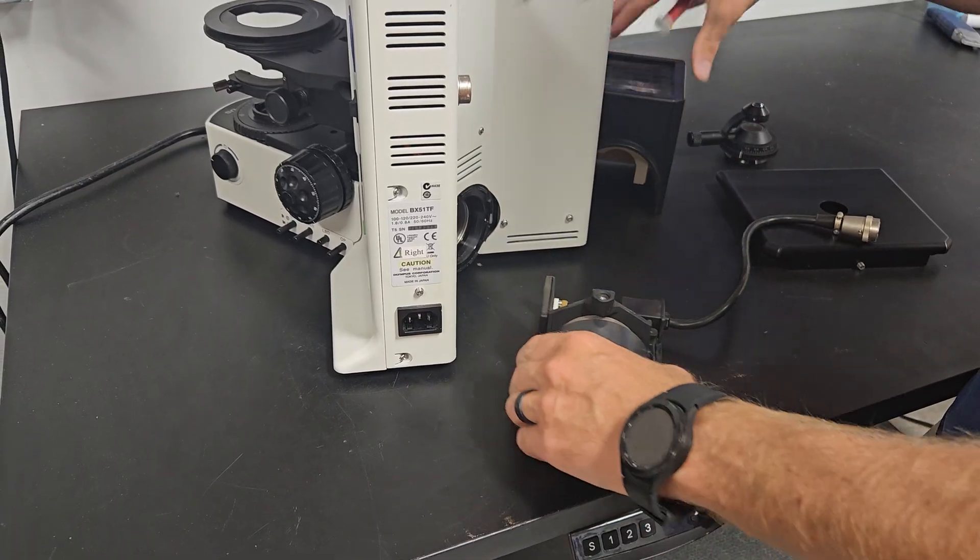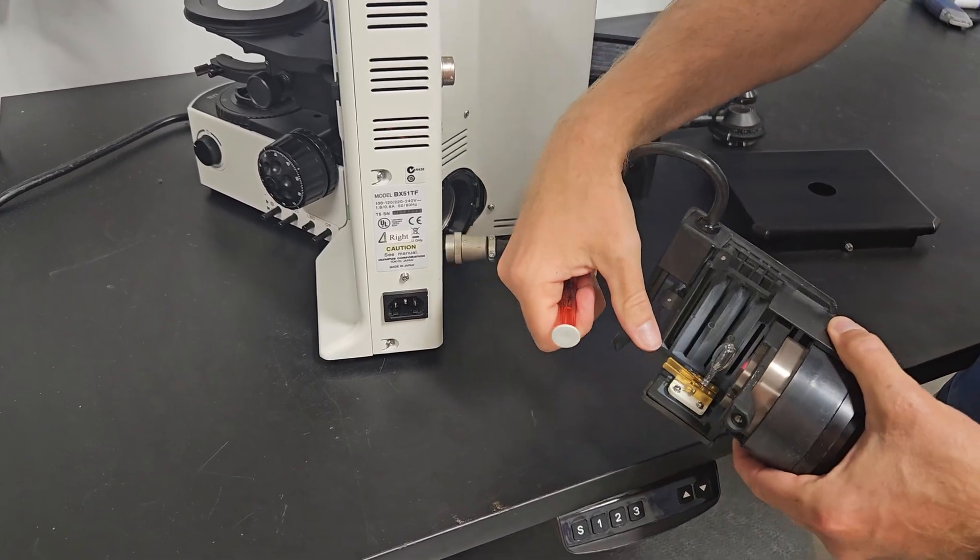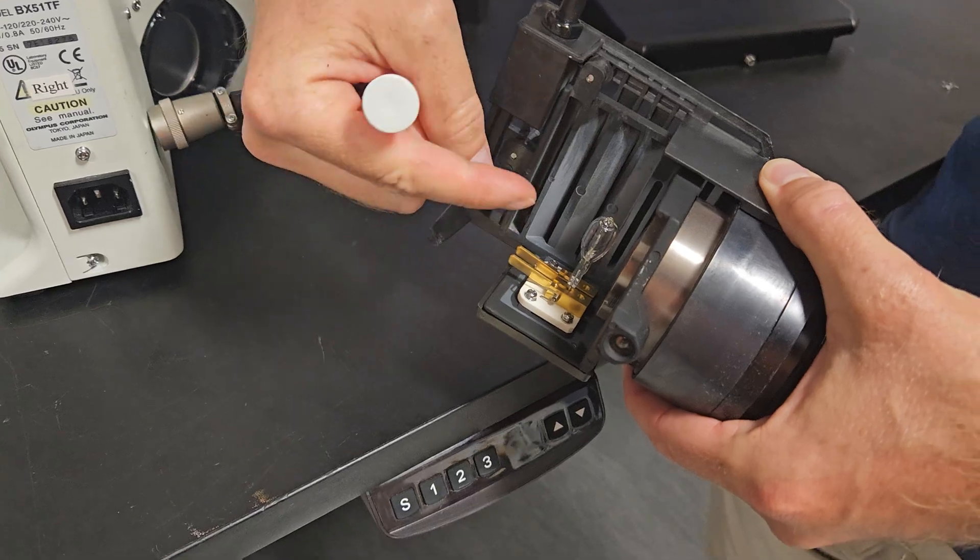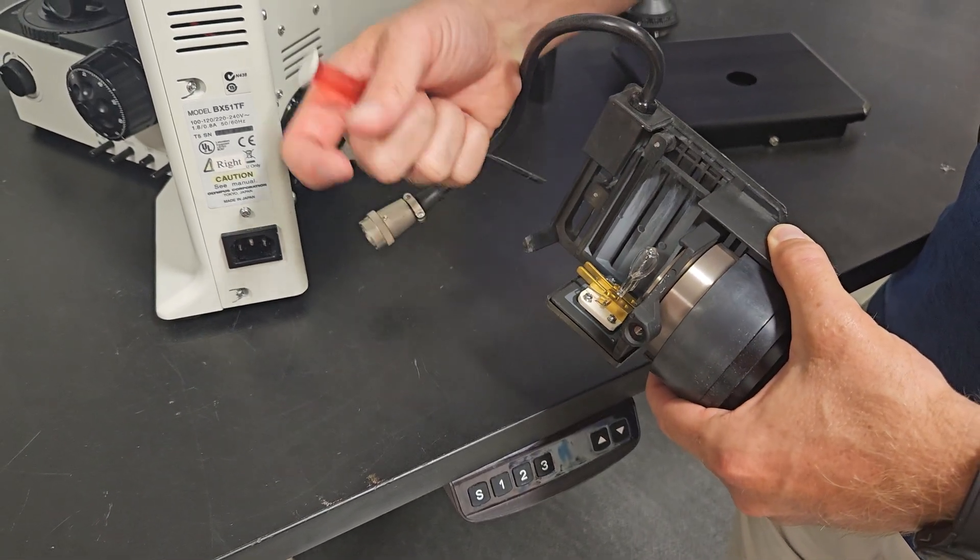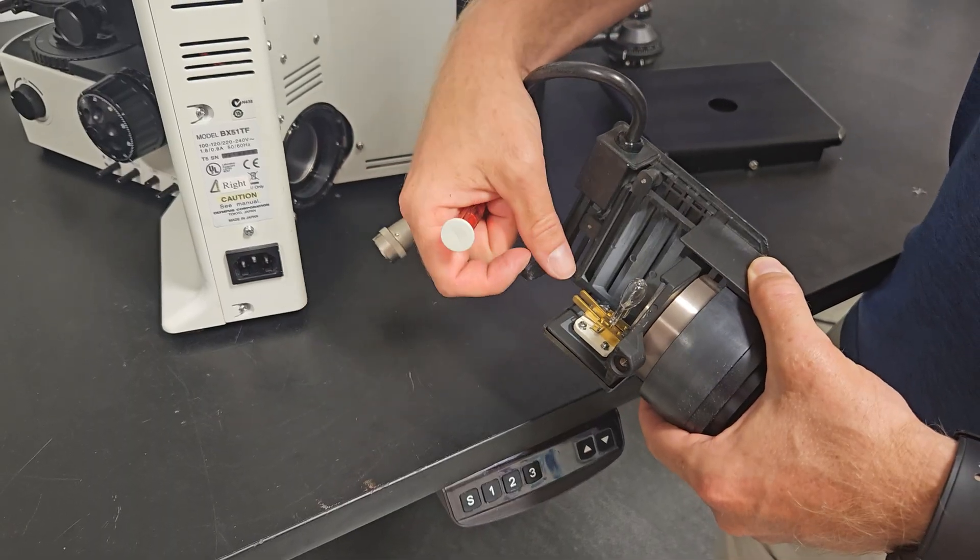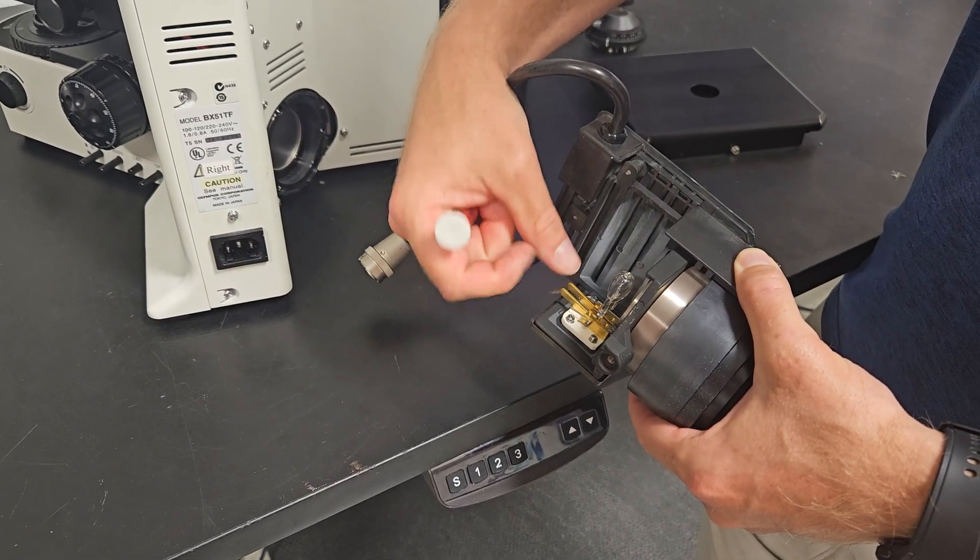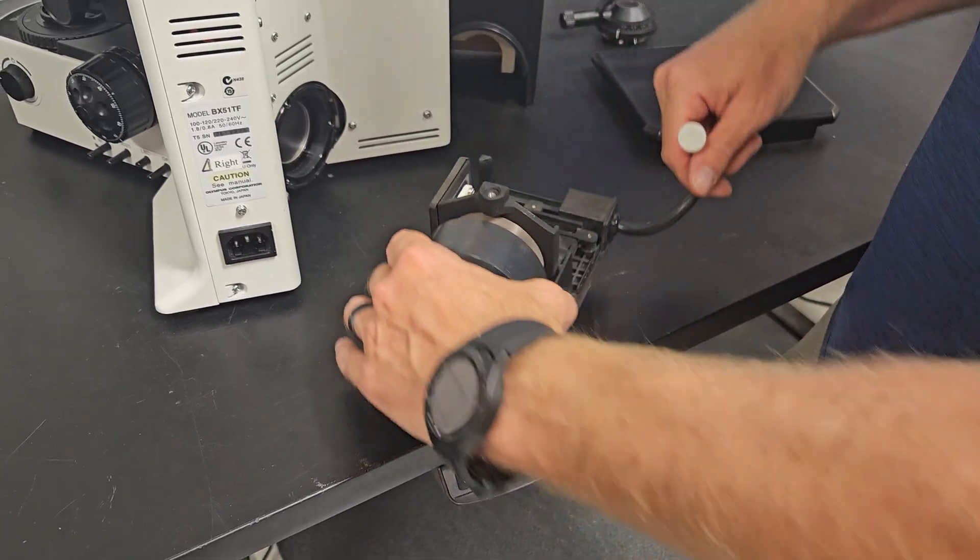I was running this scope, so it's really hot, so we're not going to take it out, but you would press these prongs down, grab the bulb with a Kim wipe, lift it out. And then without touching the new bulb, use the protective wrapper or another Kim wipe, push these pins down and insert the new bulb. So very, very simple.